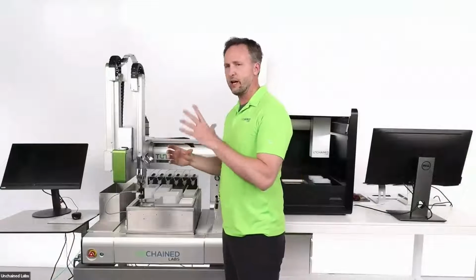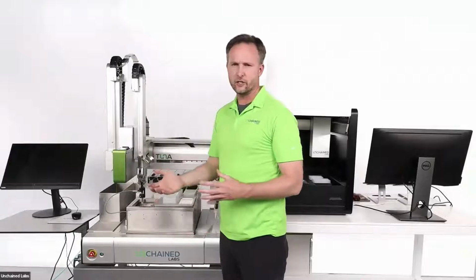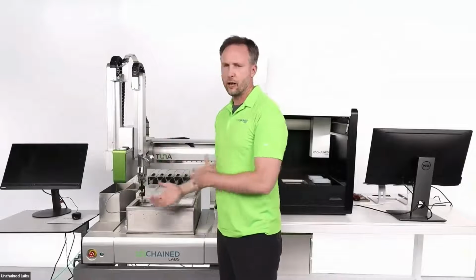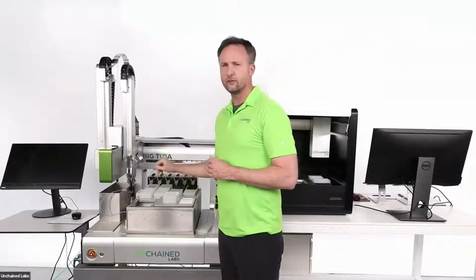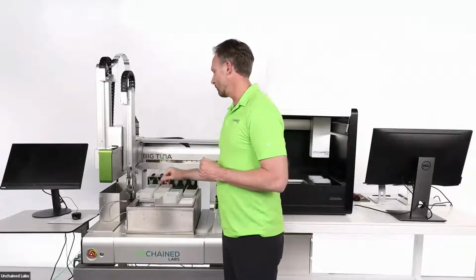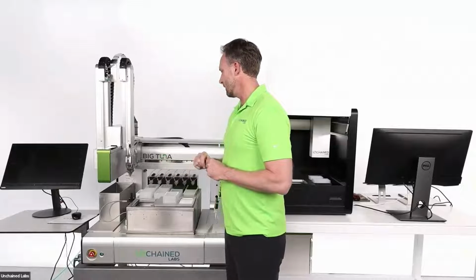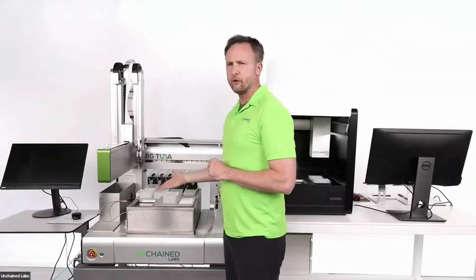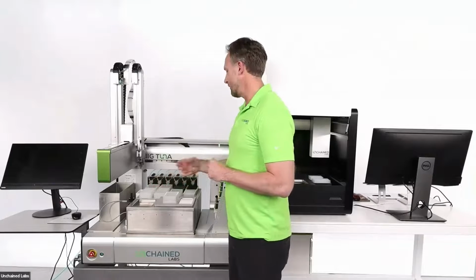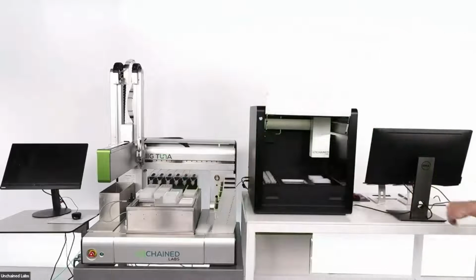So what that means is you might have a mixture of slow and fast running samples due to minor variations in concentration or perhaps formulation differences. This volume measurement makes sure that those fastest flowing samples are not going to be dried out. And so next step, I'll let you watch this. It should go over, close the buffer exchange chamber door, and then apply that pressure there. And the next step would be to grab the tips.